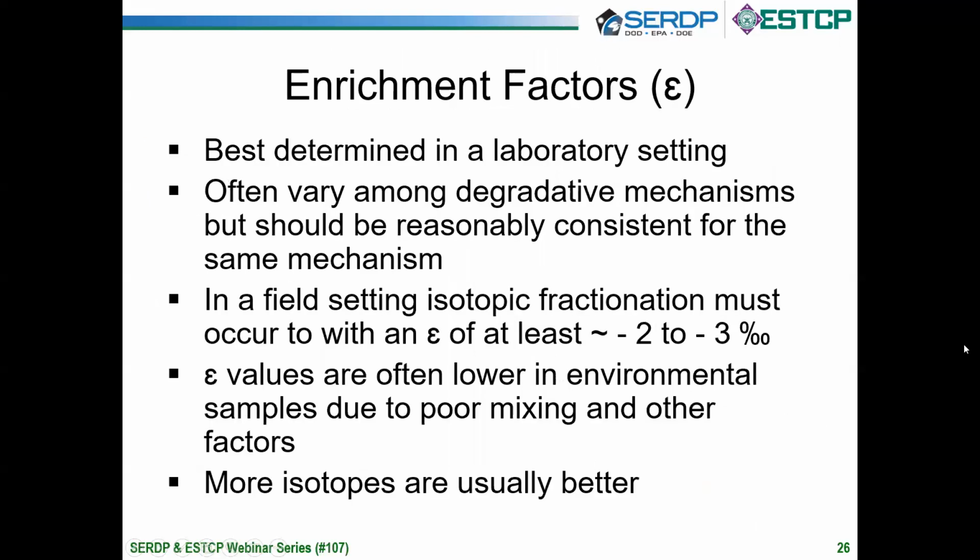Okay, so enrichment factors. You're not going to determine these yourself typically unless you're a scientist that does this. They're best determined in a lab setting, either with pure cultures if it's biological, or pure mineral if this is an abiotic study. You can also do this enzymatically. They often vary among degradative mechanisms, but they should be reasonably consistent for the same mechanism.